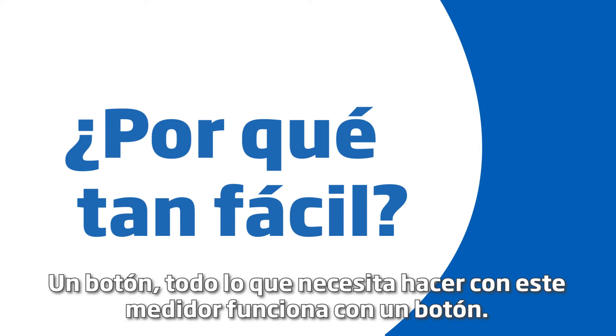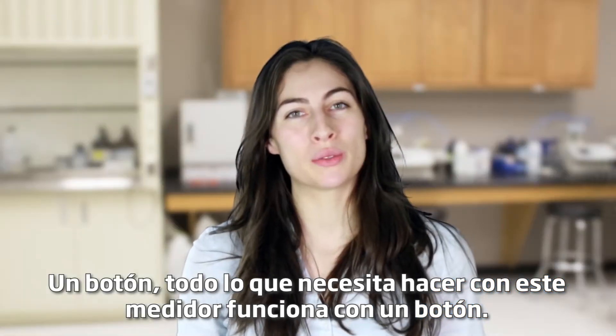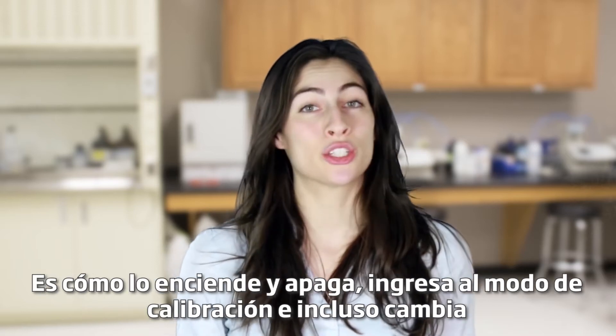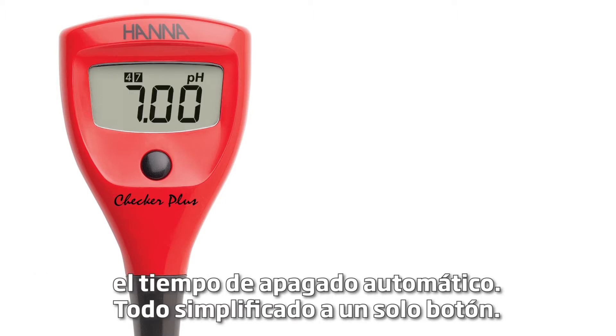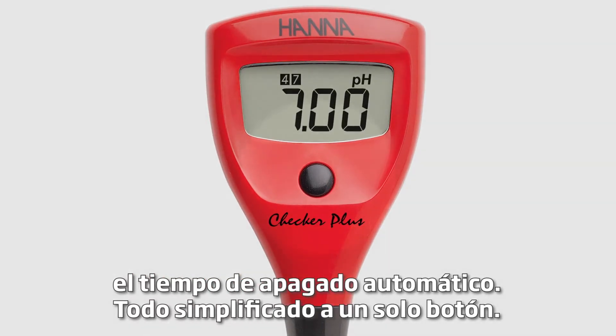One button. Everything you need to do with this meter operates with just one button. It's how you turn it on and off, enter calibration mode, and even change the automatic shutoff times. Everything simplified to just one button.